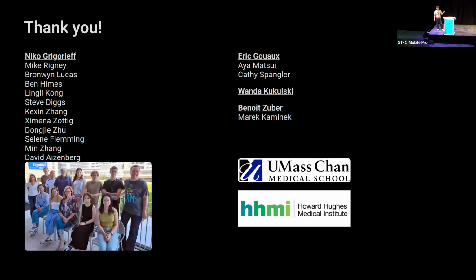There is other data out there suggesting that you can do high resolution structural biology in CEMOVIS samples. I think you should talk to René Frank about that. And I think there was also a study using 2D crystal scattering. So yes, there's data on stuff other than ribosomes, but 2D template matching becomes quite hard on things that are smaller and less abundant than ribosomes, and that's definitely ongoing work that is challenging.